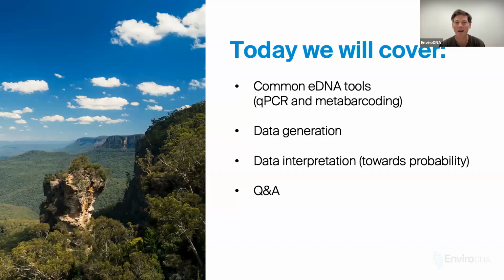hold people's hand on the way towards a more probabilistic understanding of their data, which is inherent in a lot of methods, but is particularly problematic, I guess, for eDNA when we are used to more familiar methods. And it's entirely natural that eDNA as a fairly new toolkit is subject to a lot more scrutiny. We want to help people better understand that so that they can use it more usefully.